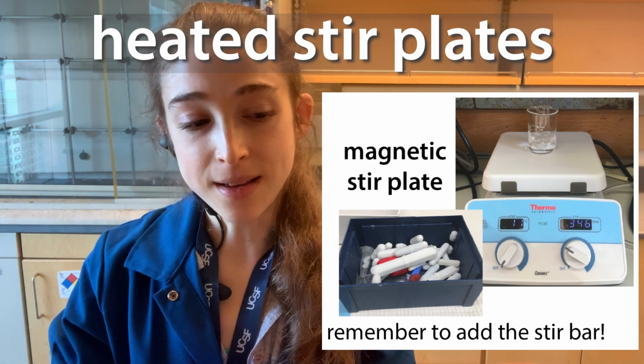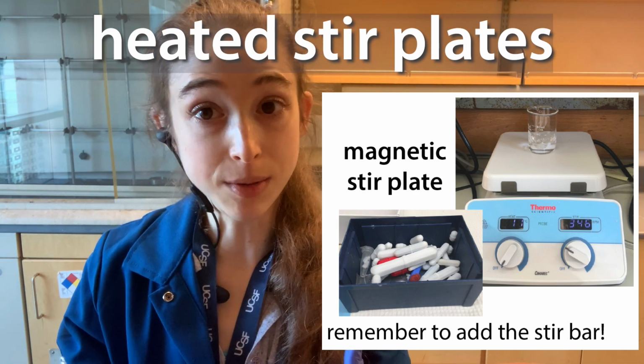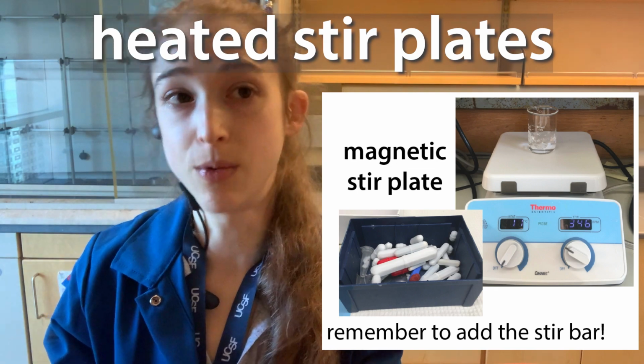And make sure that if you do want to use the heat, you're actually using one of the plates that has the heated element, because a lot of them don't, and they look pretty much the same, except that one will have 2 dials and one will just have 1 dial.